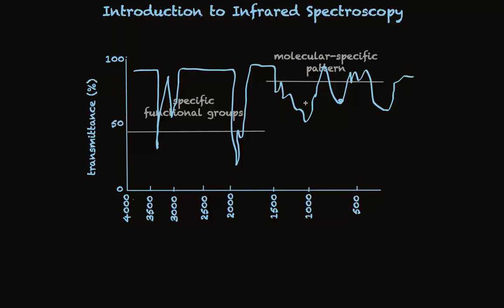This is called the fingerprint region. And this region functions just like fingerprints for people.